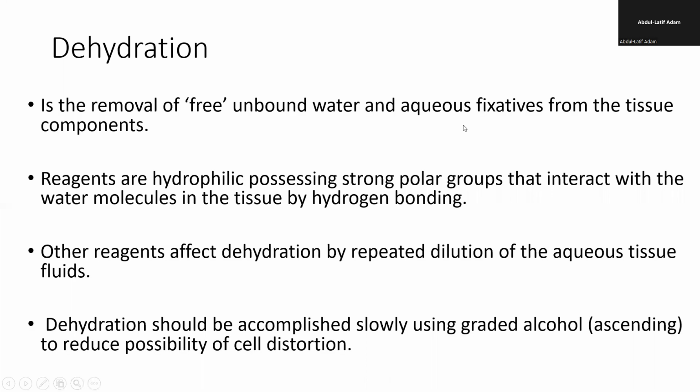So what is dehydration? As I've mentioned, it is the removal of free unbound water in the tissue, and also the aqueous part of the fixative, because the fixative is 10% formalin. For 10%, you have only 10 mL of formalin in a solution of 100 mL. The rest is water, distilled water. So you need to remove the water from it.